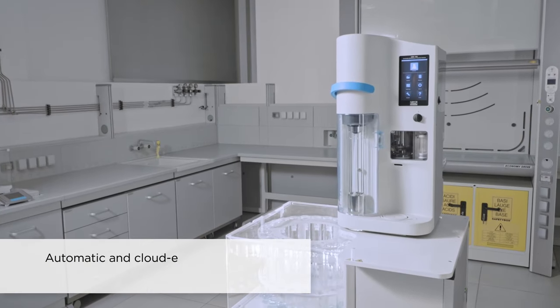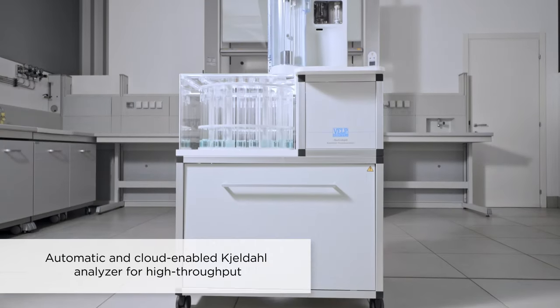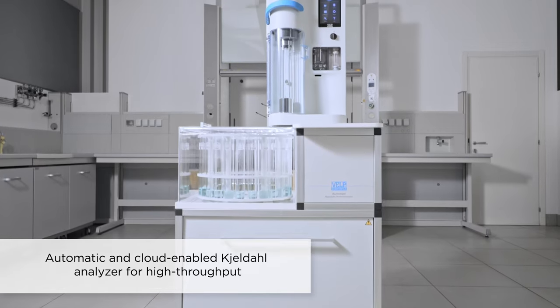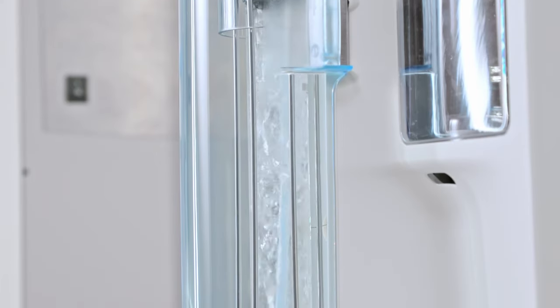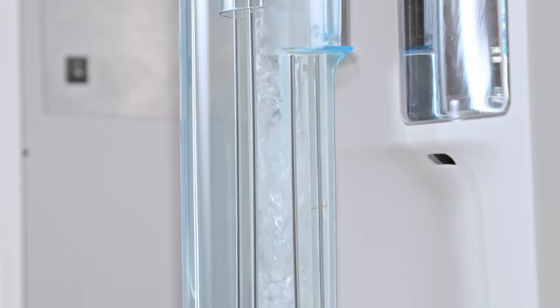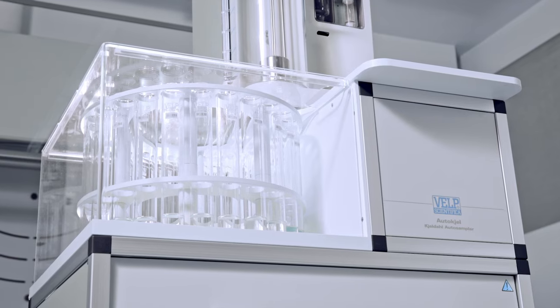The UDK169 is VELP's fully automatic and cloud-enabled Kjeldahl analyzer designed for high-throughput laboratories requiring to automatize and streamline their nitrogen and protein determination processes.